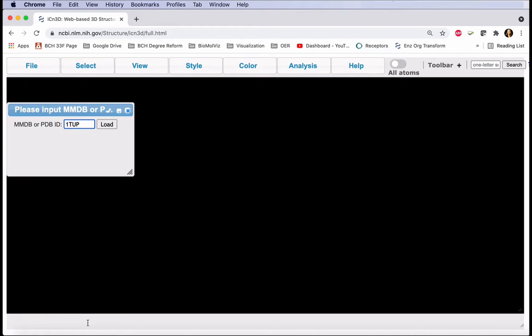ICN3D is exclusively a web-based tool, so navigate to this website, and in the block we can enter the code to load our structure, 3FGU.